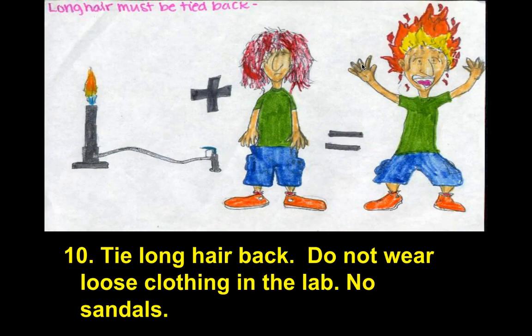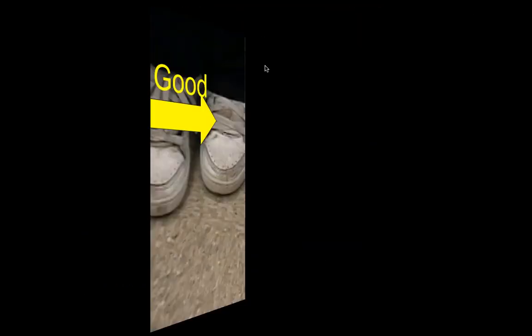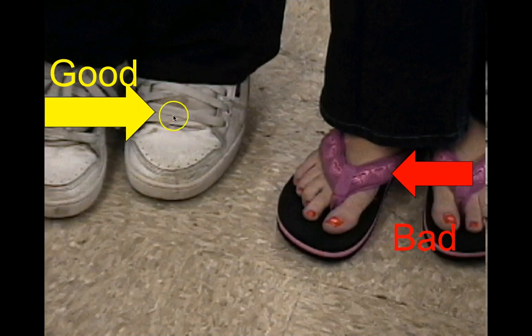Tie long hair back and do not wear loose clothing in the lab. No sandals. If you have hair longer than your shoulders, I'm going to ask you to wear a hair tie — I can always lend you a rubber band. At some schools, students with long hair who weren't paying attention got it into an open flame and it caught on fire. That hasn't happened here, but we've got to be careful. Sometimes I'll say you need closed-toed shoes for a lab; just go to your PE locker and get your gym shoes.